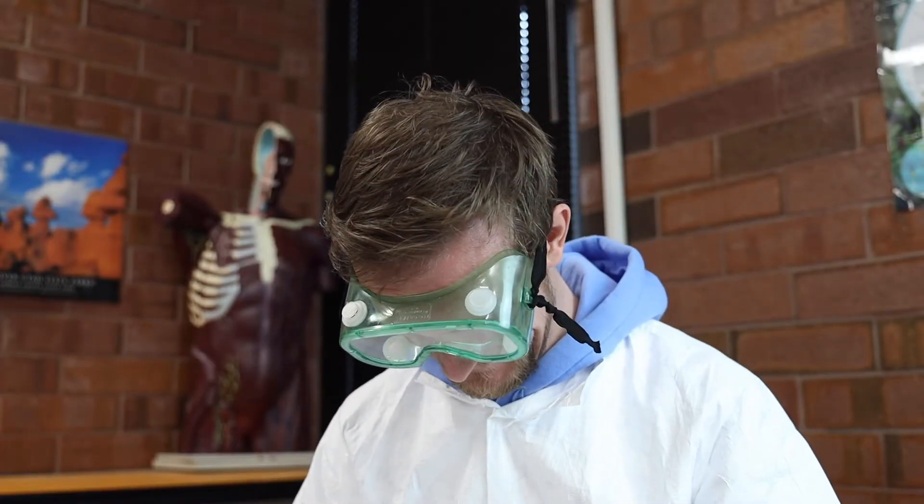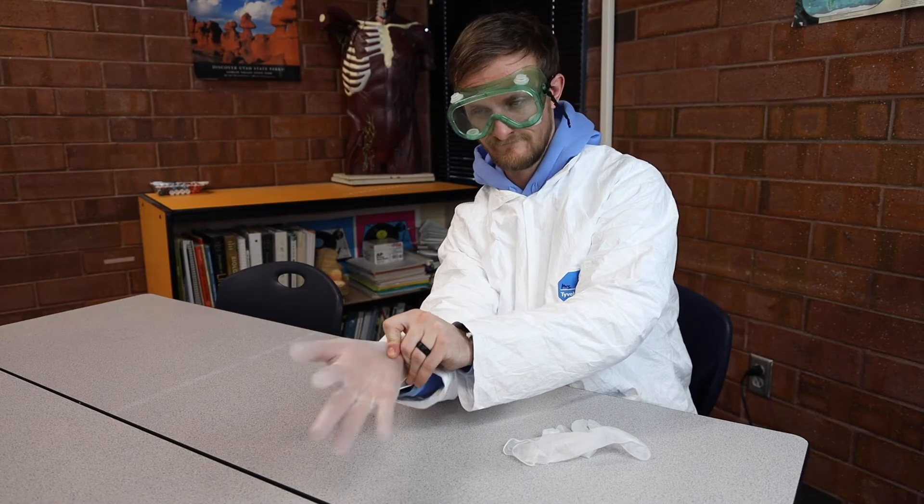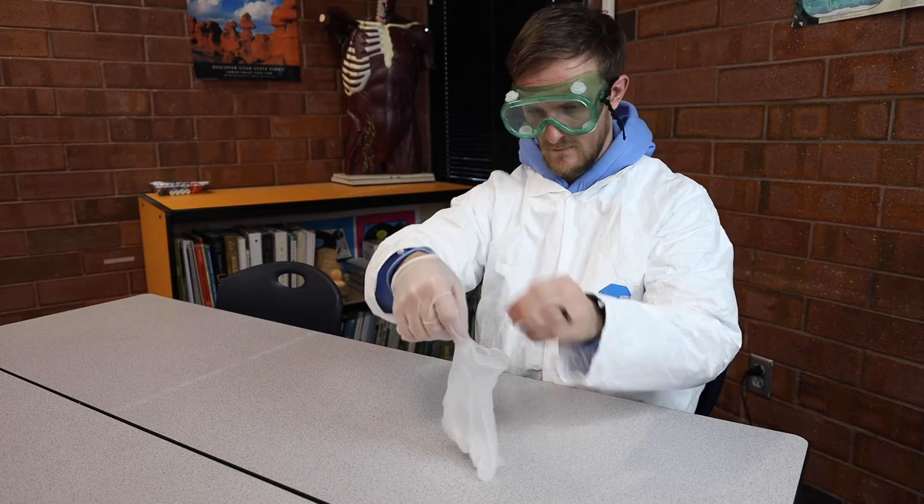The first step in ensuring that your dissection is both safe and fun is protection. You may have noticed that I'm wearing some really smashing eye gear — that's not just for looks, but to protect my eyes from chemicals that may splash during the dissection. Additionally, I'm wearing a lab coat, which will protect my clothes from chemicals. I will also wear gloves during the dissection to ensure that my hands are safe from any chemicals used to preserve the dissection specimen.